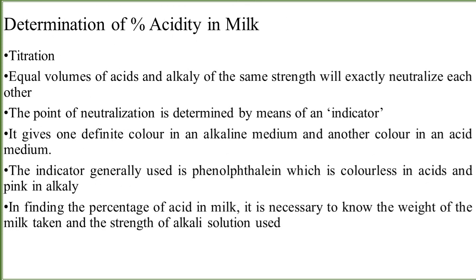Determination of the percentage acidity in the milk. First one, titration. Equal volumes of acid and alkali of the same strength will exactly neutralize each other.